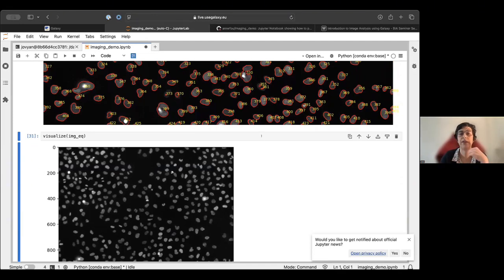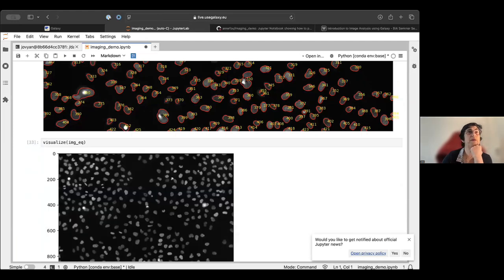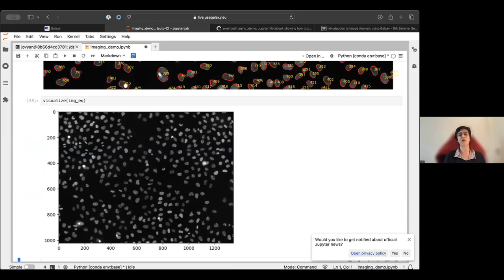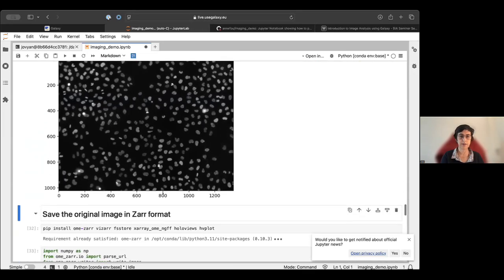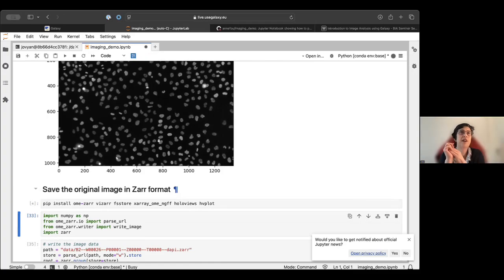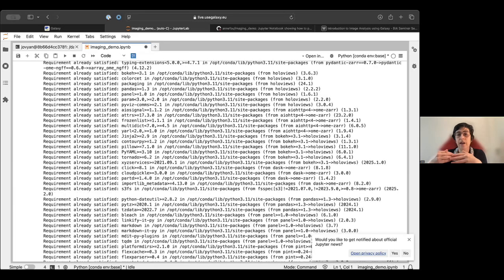And here you have the full Python ecosystem, and you can install any new packages. So, for instance, I wanted to show you here. I still have a bit of time, I hope. So here I'm going back to one of the images we had at the beginning, where we can see all the different cells. And I wanted to show you, for instance, we can save the image in a different format. So here I'm trying to use the OME-Zarr format. It's maybe not super relevant because this image is originally a TIFF format, but this is to show you what we can do. So as a prototype, I can install new packages.